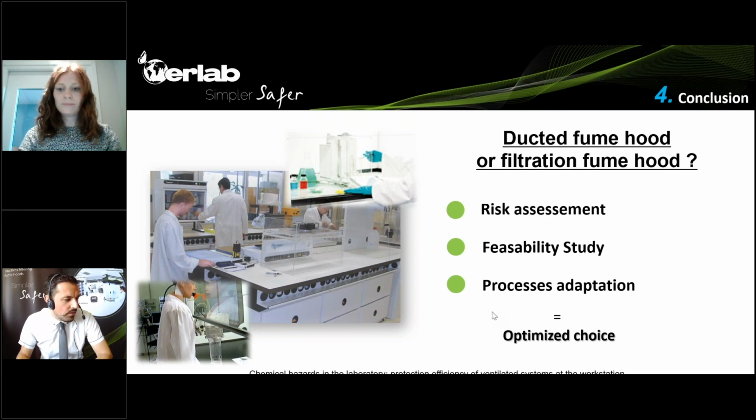I don't know if you are aware of occupational exposure banding, and there is a hierarchy of occupational exposure limits depending on the risk, and some of the requirements depending on the powders and the toxicity. They are not allowed to be handled under a ducted fume hood. So I hope it answers your question.